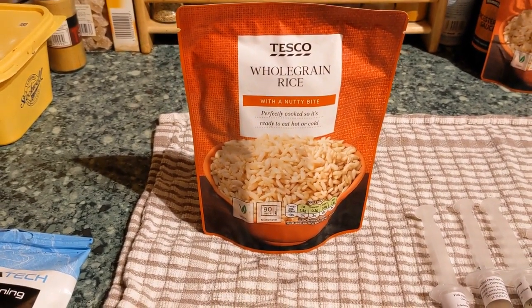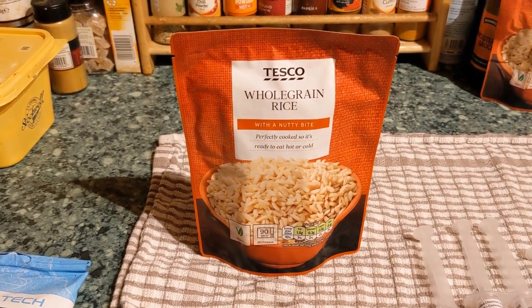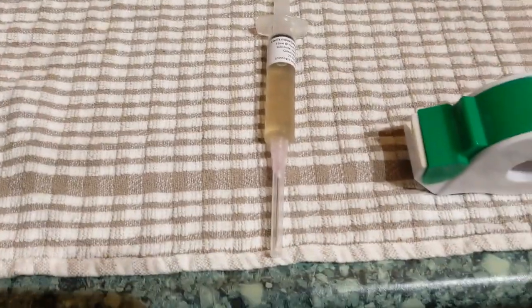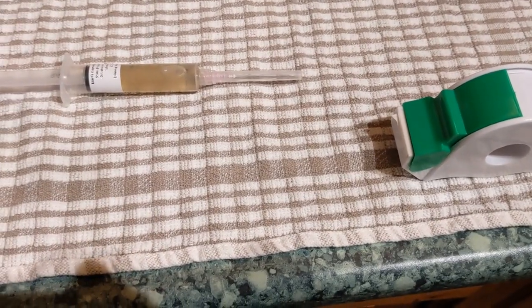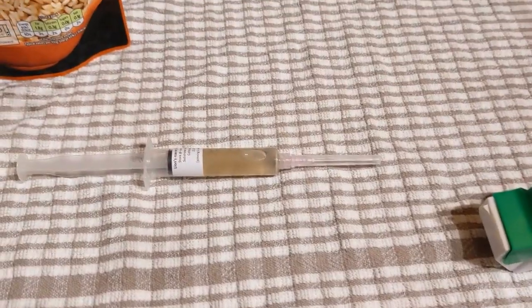So I think we're ready now for the inoculation. Now I'm going to be using the lion's mane. So I'll just move those out of the way. That's the lion's mane. The cap is still on the needle, but just for extra security, what I'm going to do is I'm going to cleanse by fire the needle, just in case there is anything on it.